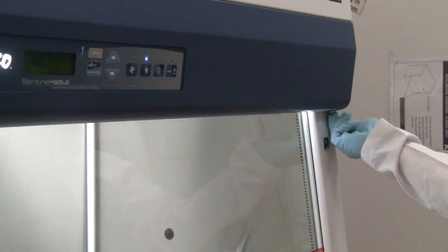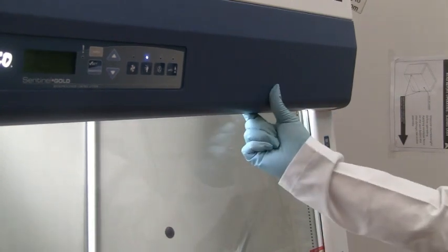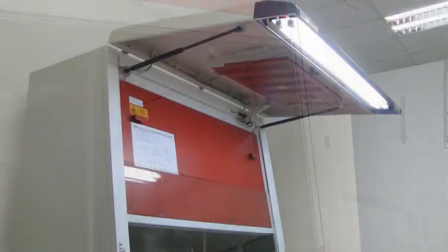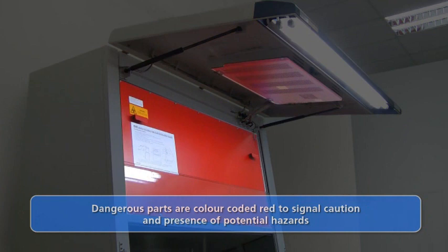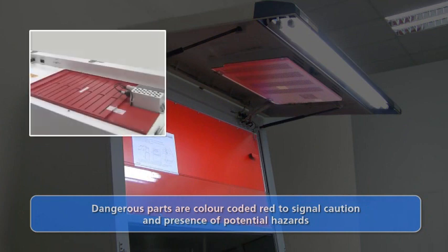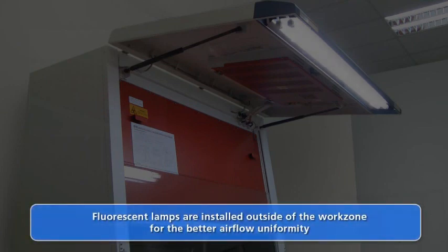The front surface panel provides service access to cabinet modules and is easily opened by removing the screws on both sides. Parts that are potentially contaminated and hazardous, such as the blower plenum or the electronics electrical module, are color-coded red to advise caution. Fluorescent lamps are installed outside the work area to minimize obstruction to the downflow air in the work zone, and this design also ensures that the light is not shined directly toward the operator.